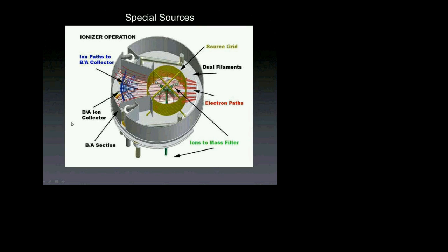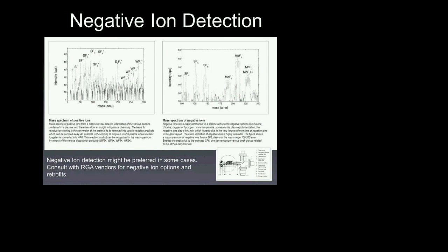The reason is that the total pressure ion gauge in this design is not as good as a bare Bayard-Alpert ionization gauge specifically designed for this purpose. And a lot of the electrons only get to go once through this ionizer, so the sensitivity won't be as good. So you literally get both, but neither one of them is as good as you would get with a specialized RGA or a specialized total pressure gauge. So that's my word of wisdom for this one.